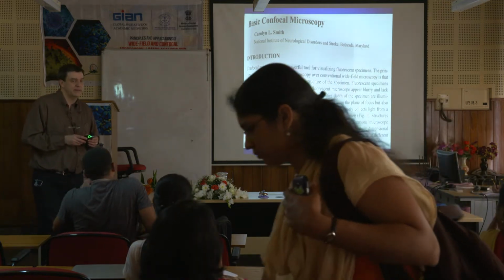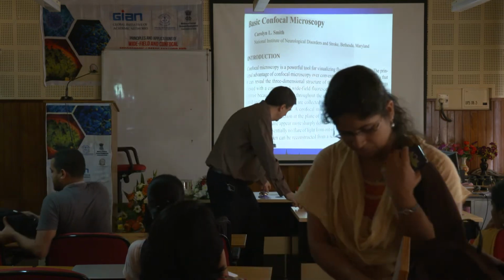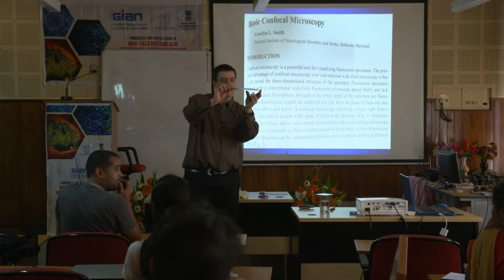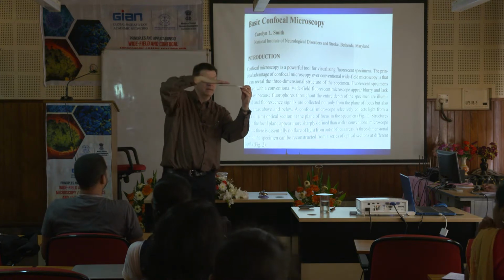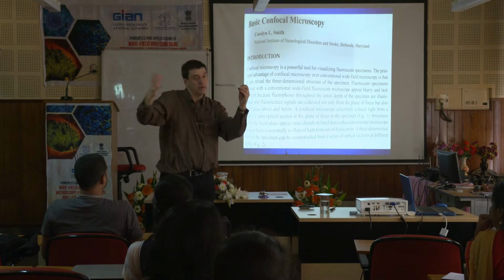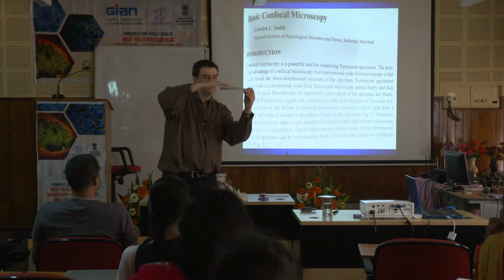Okay, so again, it comes back to the idea of what we briefly talked about yesterday, how if we're looking at this from the side, and this is what is in focus, right? With a wide field microscope, the light comes in, the light from above it, the light from below it all goes to the camera or to your eyes and becomes part of the image. Even this part that's not in focus.